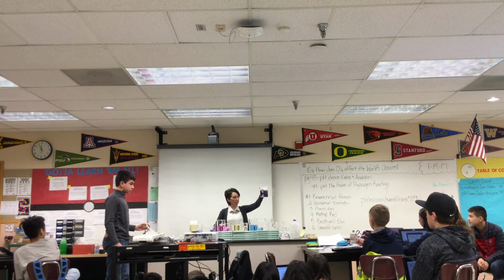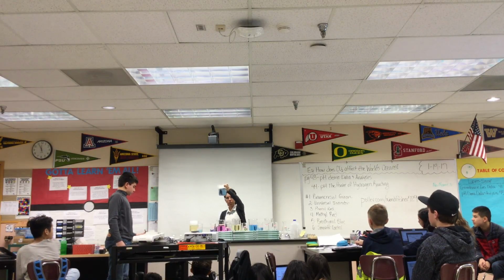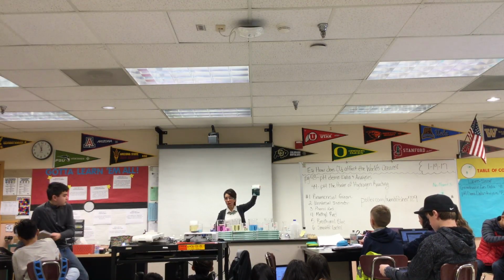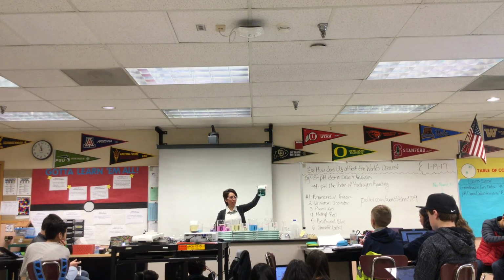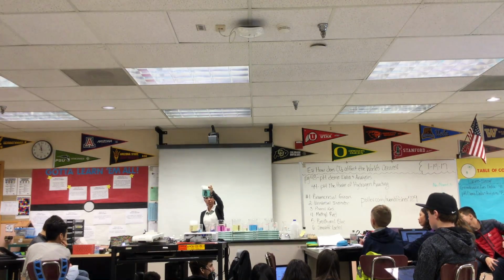So we'll get this one going. All right. So now we're blue. Yeah. Now we're a little bit more turquoise. What? I know. See, it goes really fast through green and yellow. There we go. So there's our green, right?